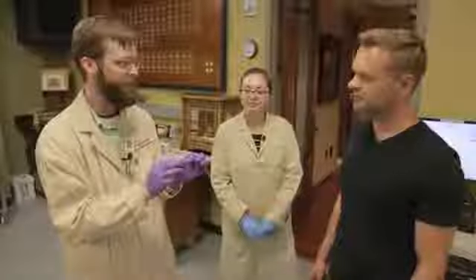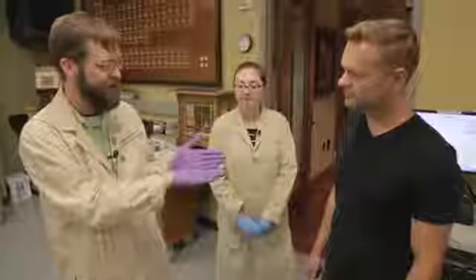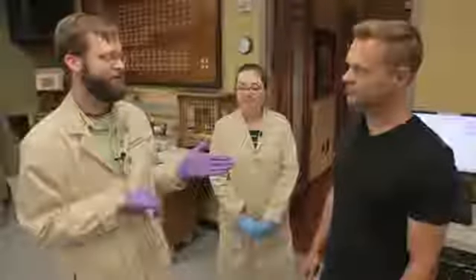And that little layer of paint, what we like to collect and call a cross-section, and then we'll pluck that little layered cake sample out. We mount it in an epoxy block, cut and polish it so that we can see the full history of the artwork from the conception to the finished product at the surface.